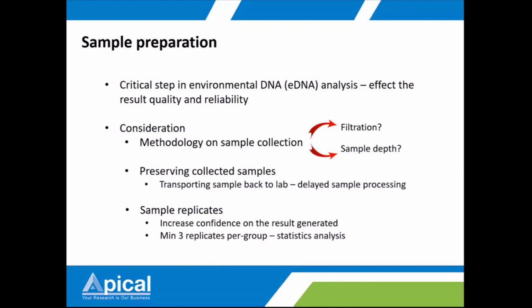The soil has different depths, and they have different organisms. So you need to have an understanding before running the sample collection, right? So that the result will be what you intended it to be. Okay, and second is preserving the collected samples.